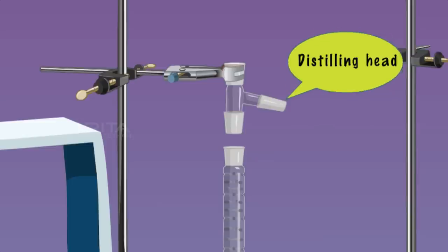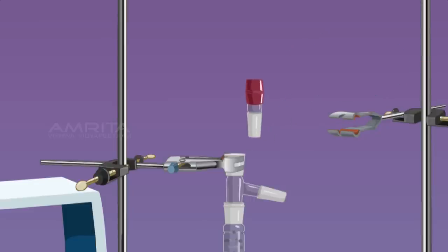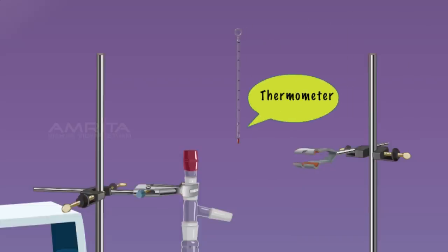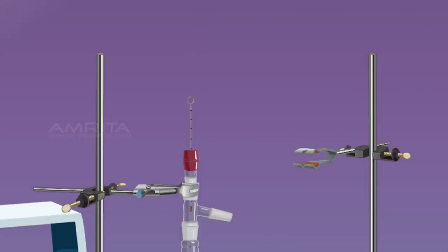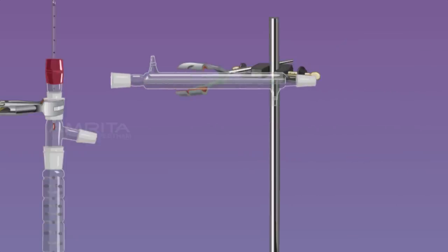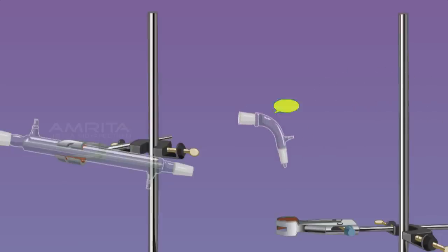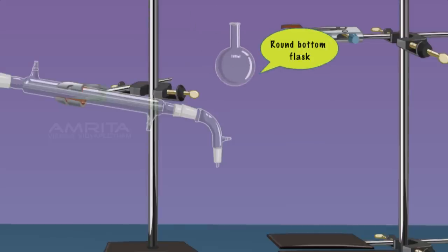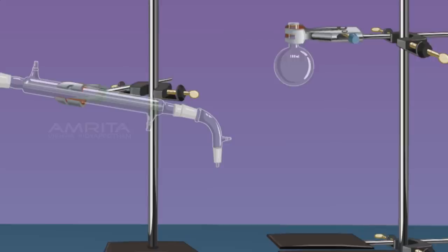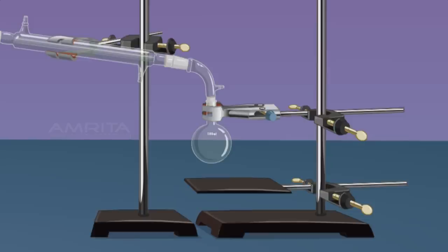Connect a distilling head to the fractionating column and a thermometer adapter to the distilling head. Insert a thermometer through the thermometer adapter. Connect a water condenser to the outlet of the distilling head. Connect a vacuum adapter to the water condenser. Connect a 100 ml RB flask or receiver flask to the vacuum adapter. Take an ice bath and place the RB flask in the ice bath.